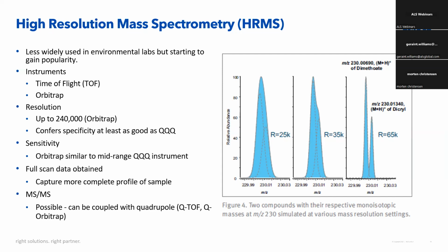We know that there's a lack of reference standards. We don't have reference standards for every single PFAS out there. So in terms of high-res MS, there are normally two options. There's a technique called time of flight, and that's provided by one of the instrument manufacturers called Agilent.